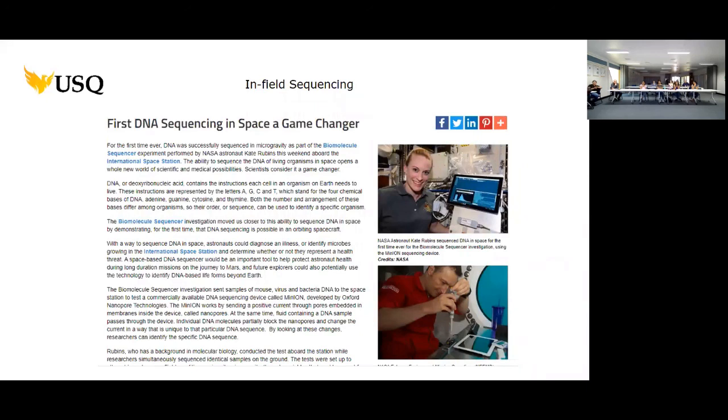There's no reason that I can think of why you would want to do whole genome assembly in the field. It's going to take you weeks to make that work, so there's no reason to do it in the field. There are some other reasons why you might want to go into the field. If you just want to be able to do a species identification in the field for a farmer, that's fine. You might not need much data. You only need to generate a small amount of data really quickly. Sure, that might be the case.